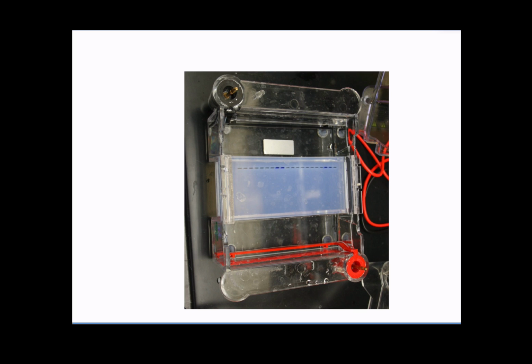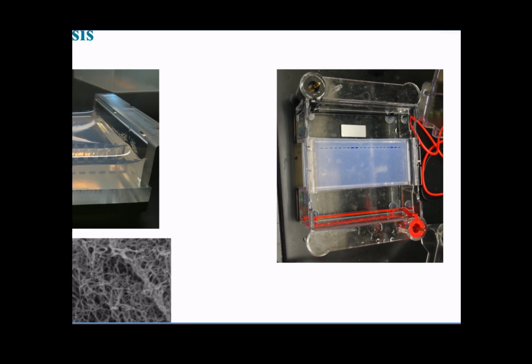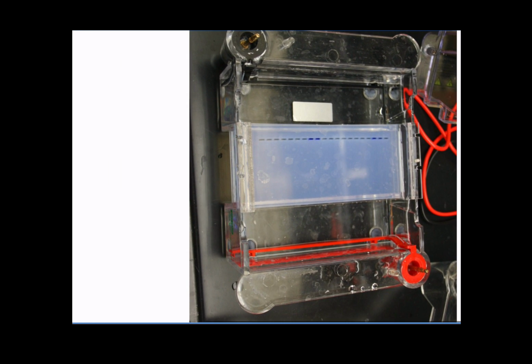Now, how can we force DNA to move through these pores? The use of electricity. And that's, if you will, the second part of the name of this technique. Electrophoresis means pulling with electricity, right? So what we do is we make use of the negative nature of DNA as a molecule.